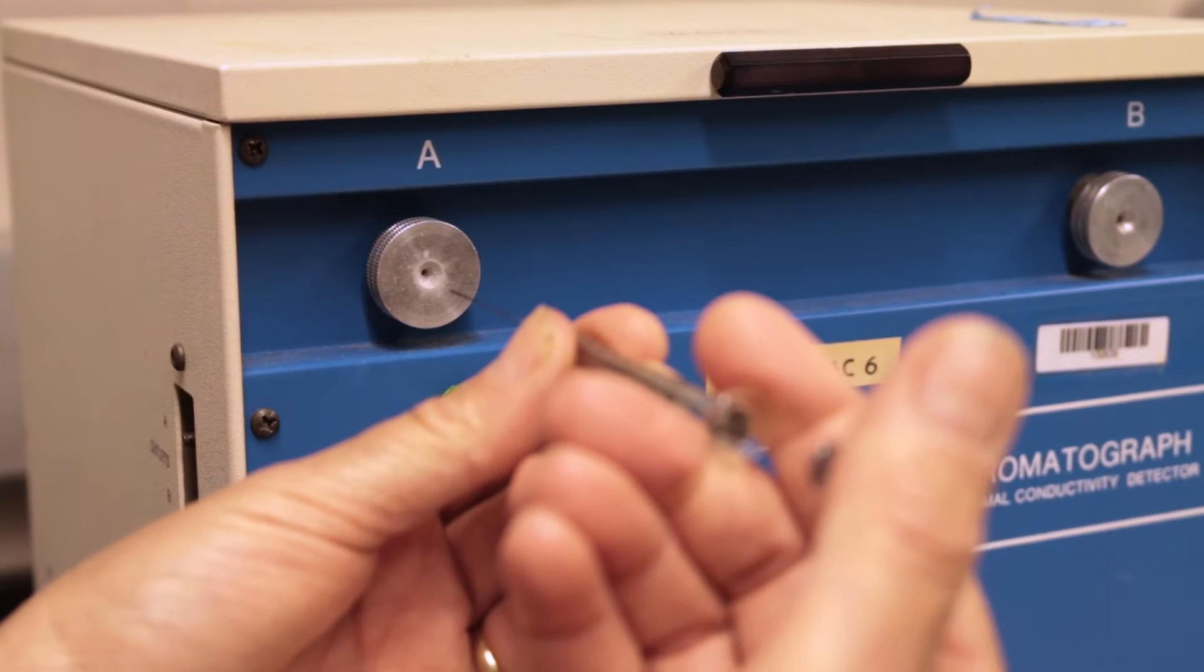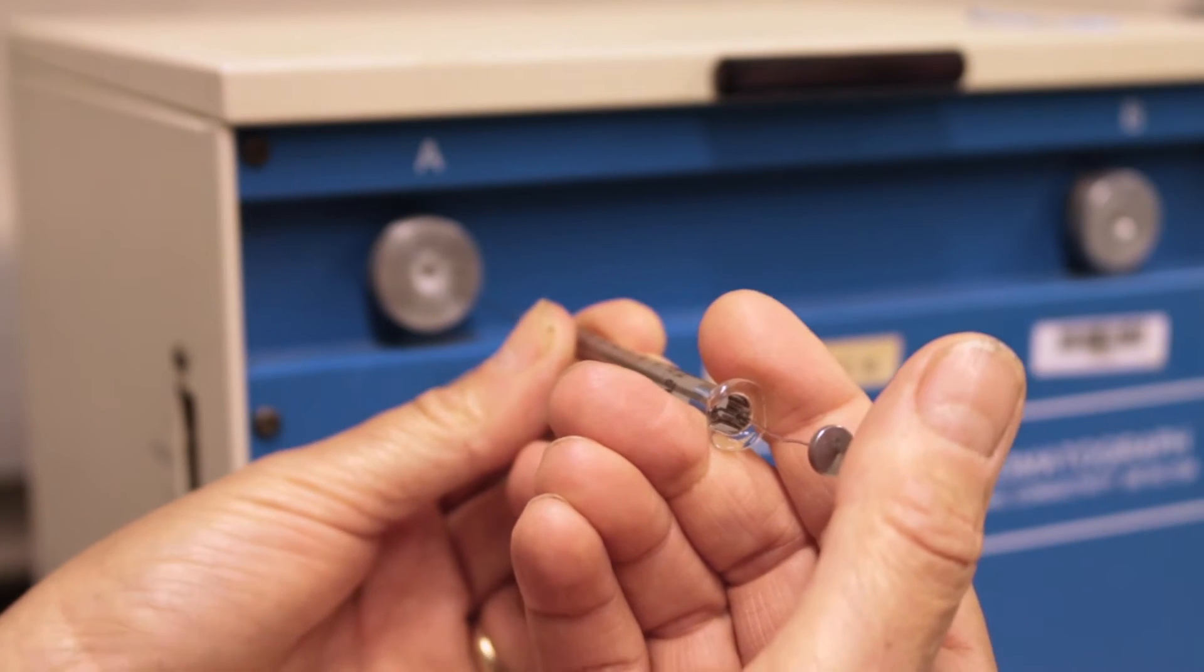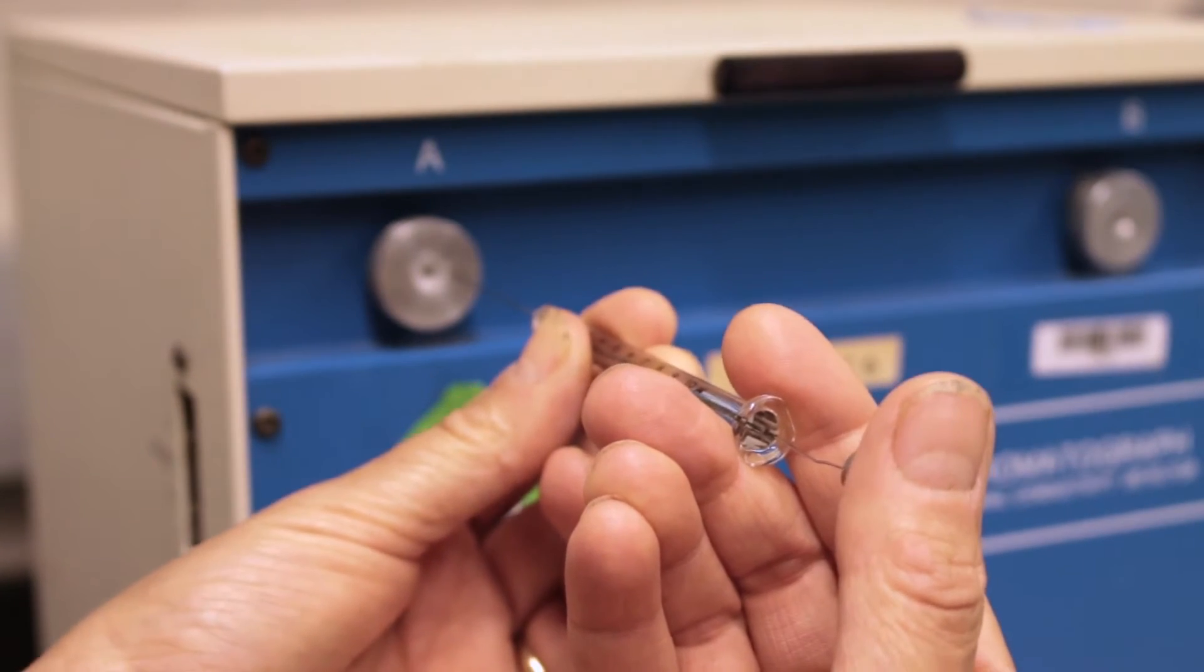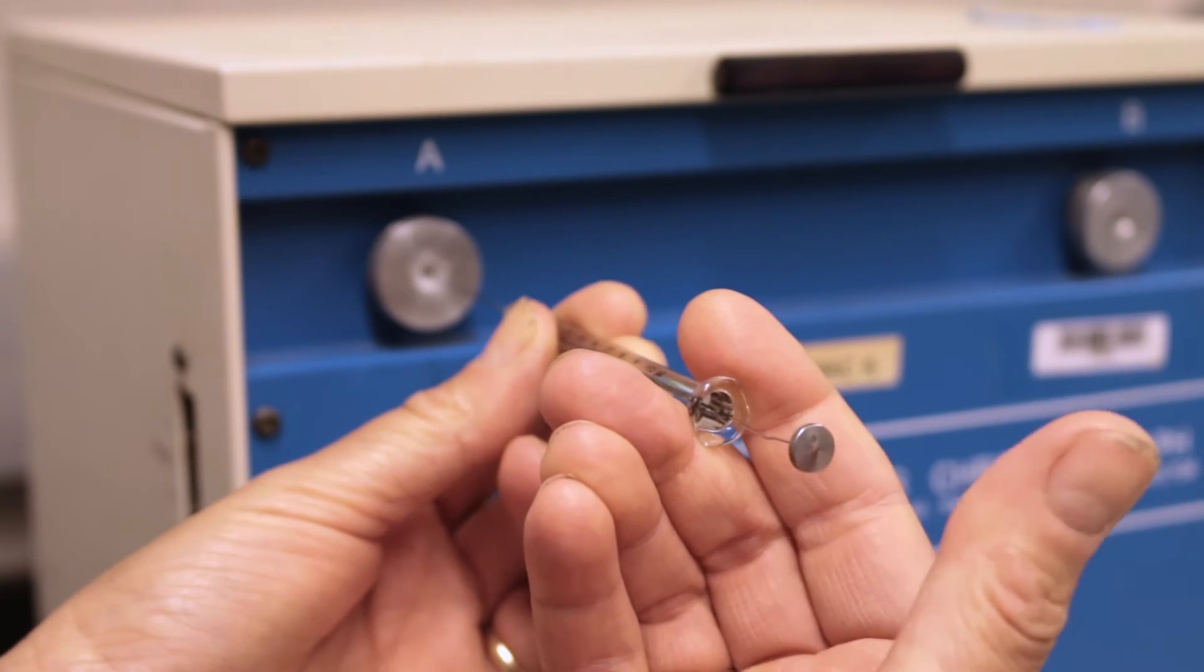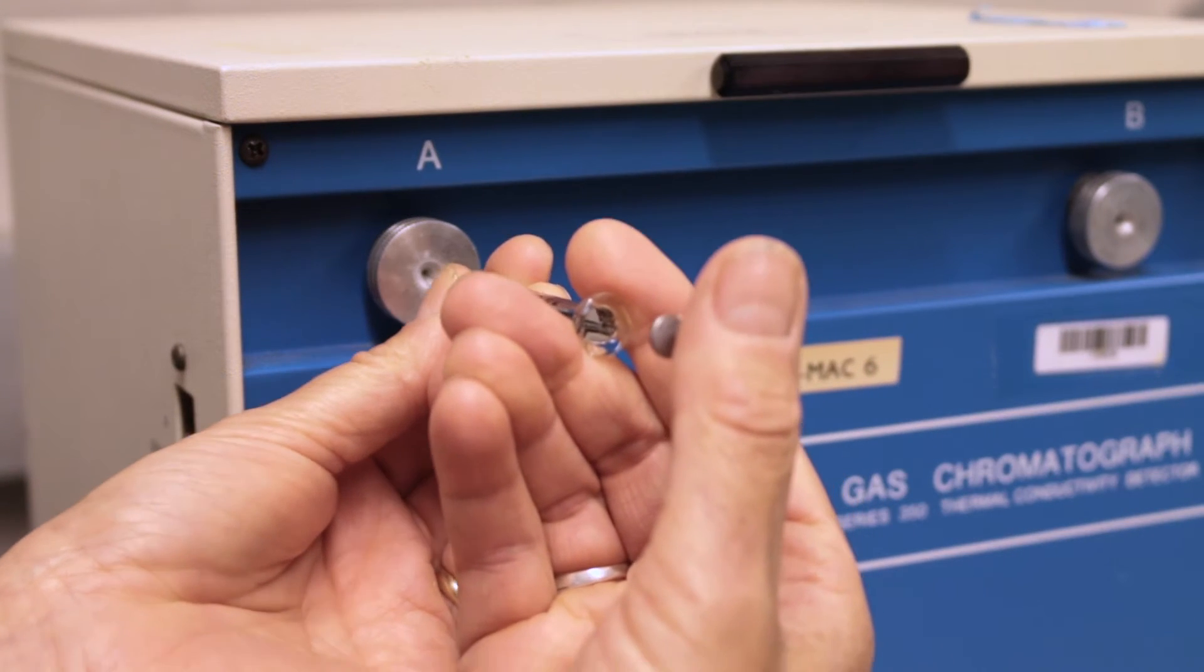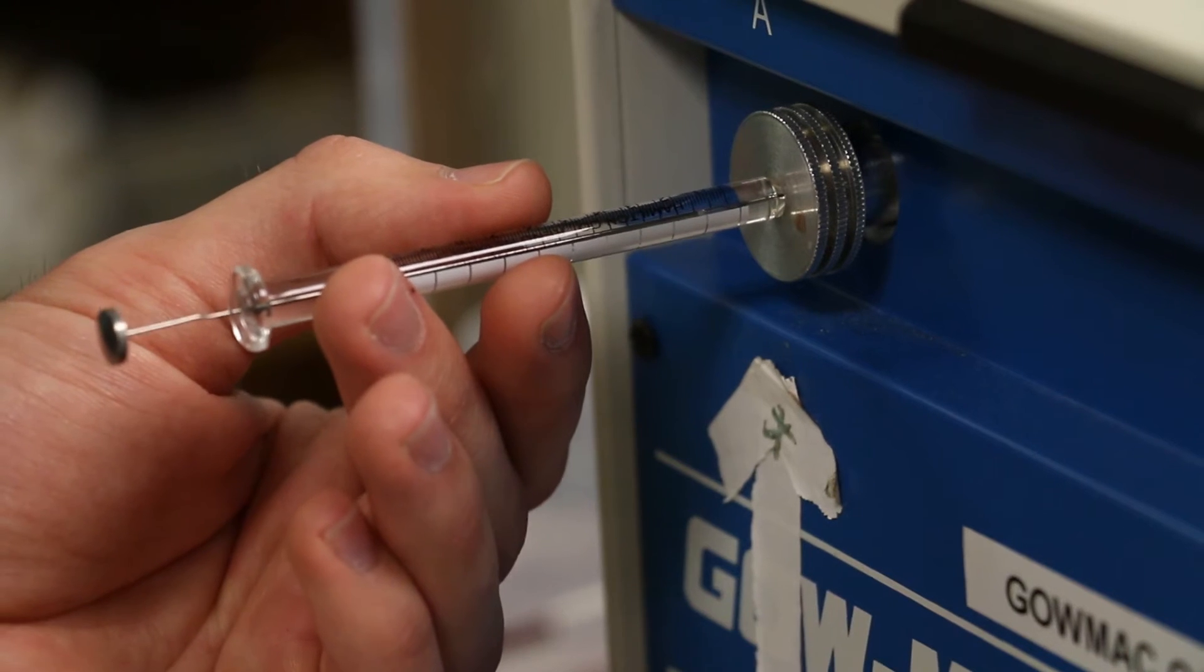Smooth injection technique is important in obtaining a good chromatogram. To inject your sample, hold the syringe horizontally using one hand to hold the glass barrel and position the thumb of the other hand behind the plunger. Using the hand on the barrel, push the needle horizontally through the septum in the injection port until the glass barrel touches the metal port.